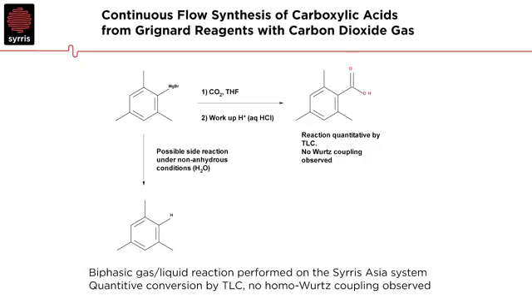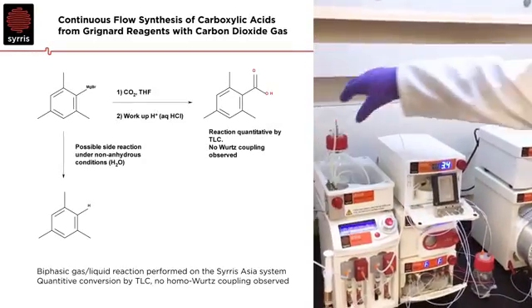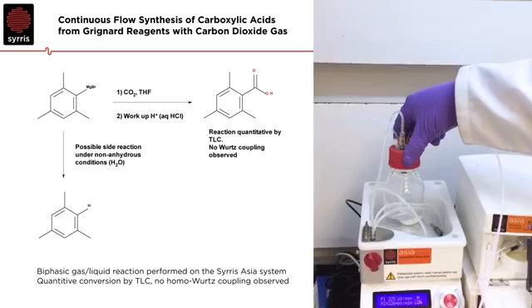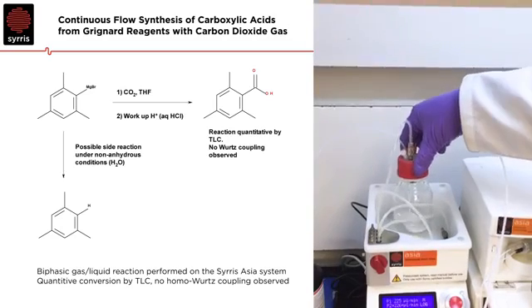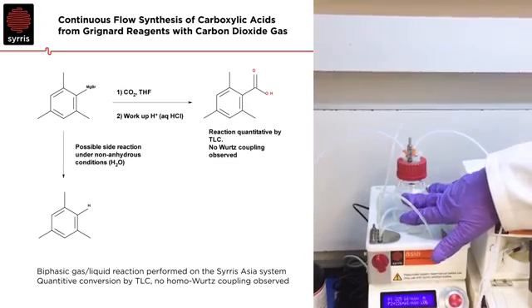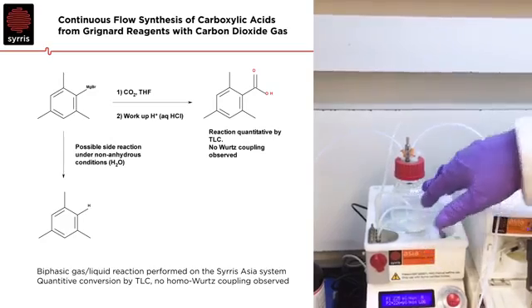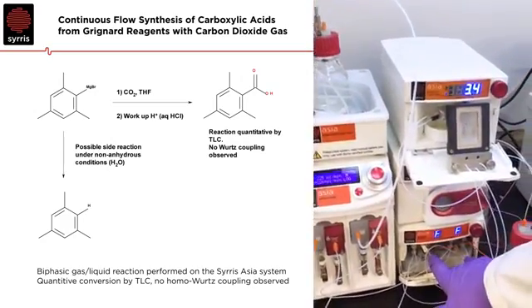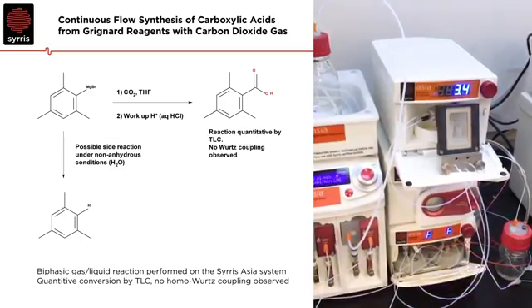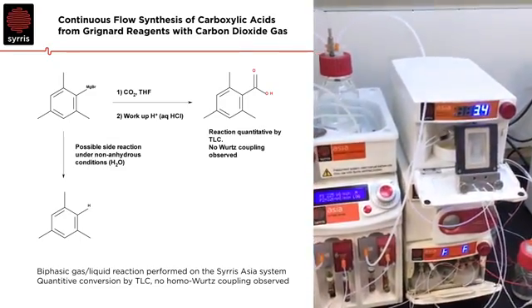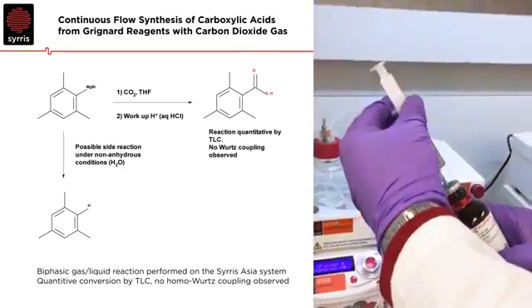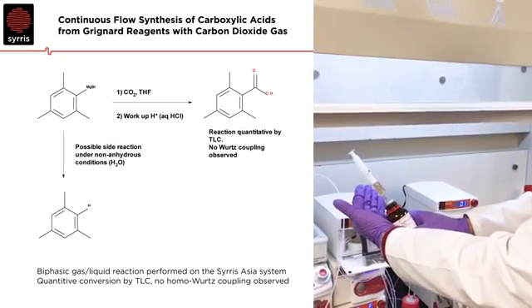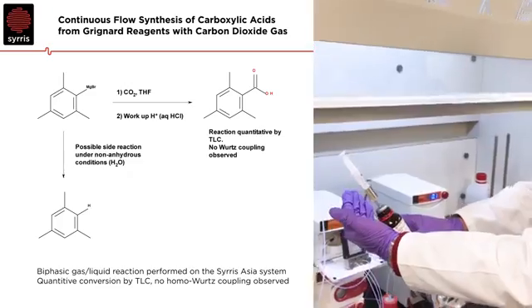To do that with the setup, we have our reagents in our pressurized input store under nitrogen, so we're keeping our solvent under inert conditions, and we're going to inject our reagents into the Asia reagent injector. You can see here our starter material is coloured, and our product is colourless.